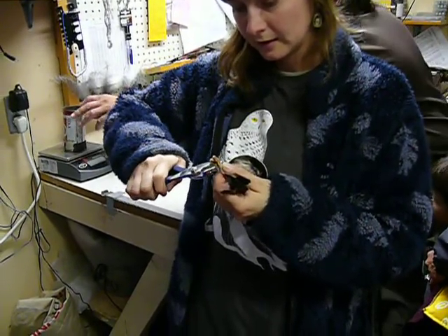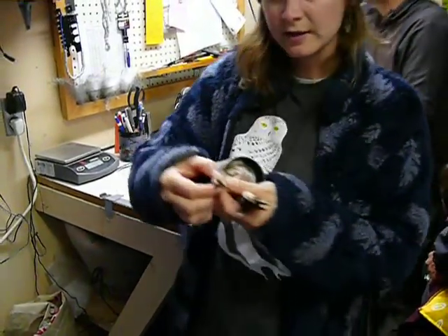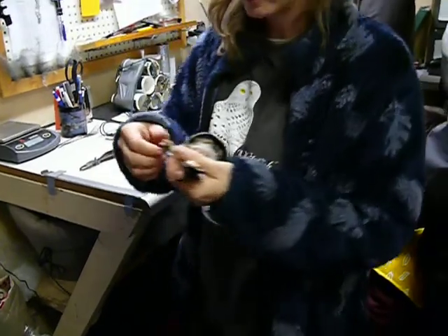What is it made out of? Aluminum. And we make sure that it fits really well so that they can't hit their bill on it or anything if they scrape it.